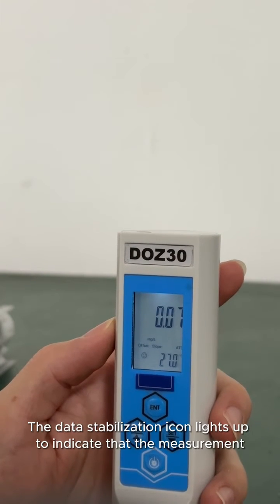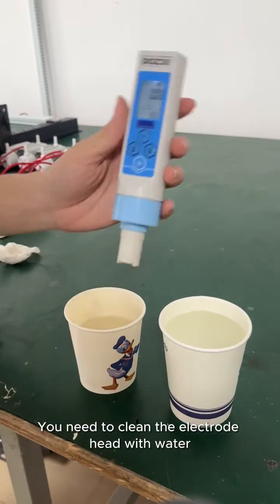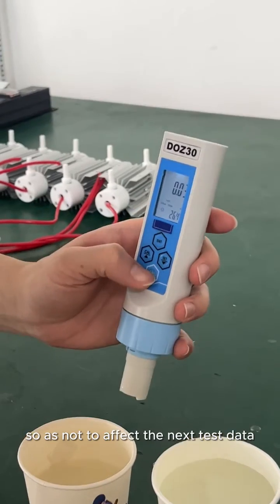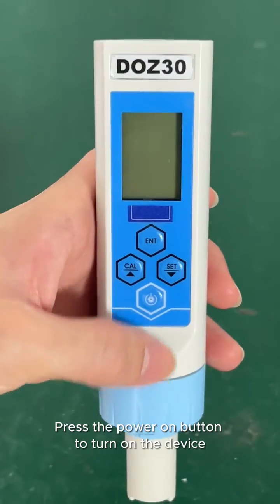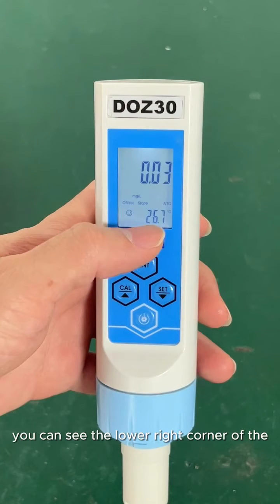The data stabilization icon lights up to indicate that the measurement is complete. You need to clean the electrode head with water, then wipe it with a clean paper towel or cloth so as not to affect the next test data. Press the power button to turn on the device.